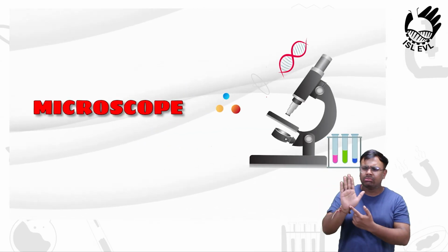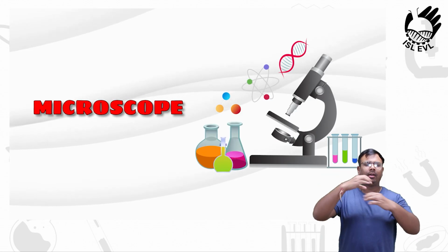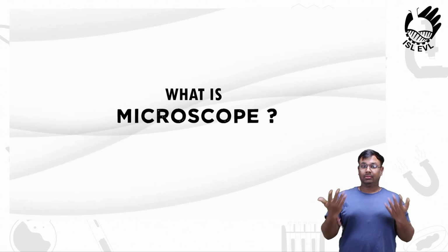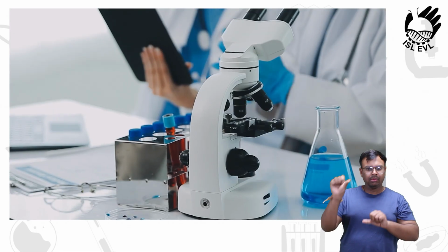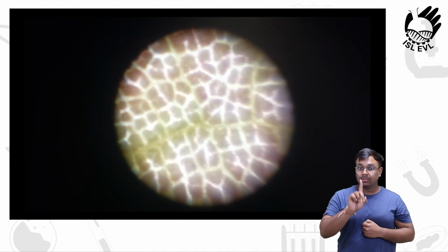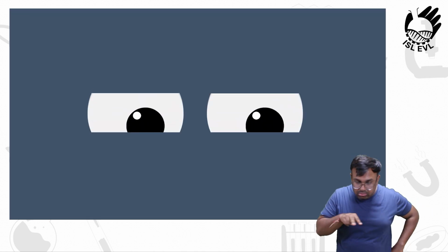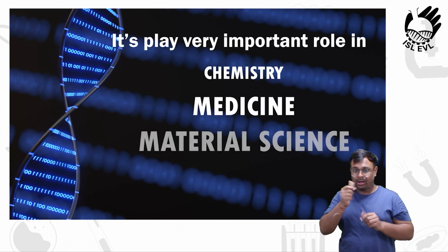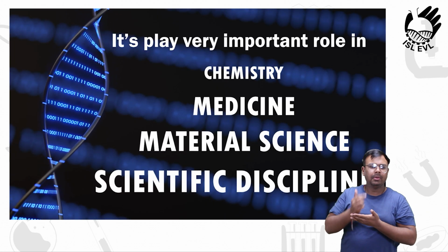In this video, we will learn about microscopes. So, what is a microscope? Microscope is a scientific instrument. We use the microscope to see micro objects, which we can't see with our naked eyes. It plays a very important role in chemistry, medicine, material science, and many scientific disciplines.